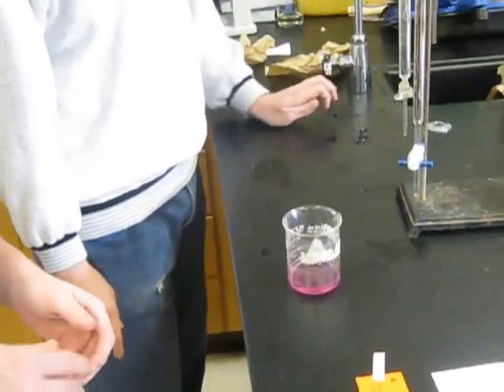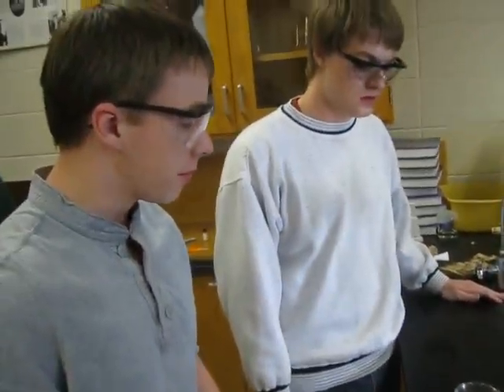Now what we do with that number is we take it back to our equation. Molarity of acid times volume of acid equals molarity of base times the volume of base, and we can then solve for the molarity of acid.